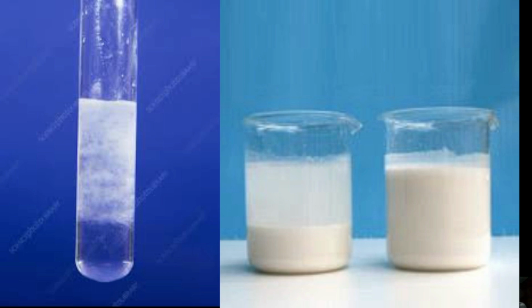But in the case of the gelatinous precipitate, it is hanging. So if you want to find out what we mean by gelatinous, just look out for the one that is hanging. The picture we have here on the screen is the gelatinous precipitate. Why is it gelatinous? Because it is floating. More or less, see it like that: when you consider gelatinous, you're looking at the floating precipitate.